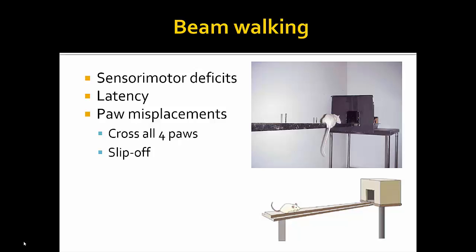To answer your question, yeah, I find it easier to score simpler tests, because sometimes you have to move angles. We're kind of lucky because of how our room is set up, it stays in the same place and the camera can take a wide range. But for this case, we also do it live. We do locomotor and other tests that we video and look at later, and you're kicking yourself because the camera moved a little bit or something like that.